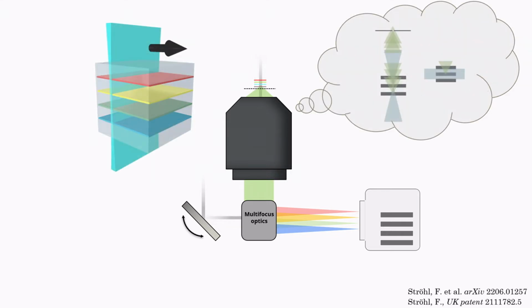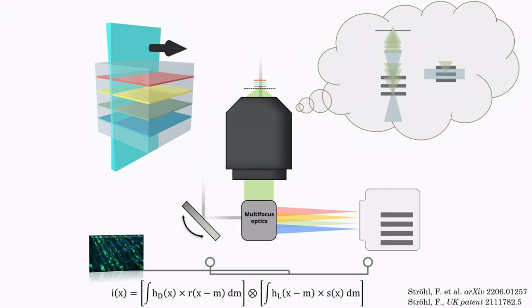And you can read about it in a bit more detail in the arXiv paper that got out, I think, 2 days ago. And that's, we put a bit of a drizzle of confocal microscopy in there. Think of it like this. If you connect your light sheet with your camera, and you would move the camera along, that means the PSF of the camera moves along with the PSF of the light sheet. Then in the math of the formula, these two move together, and under the convolution, they multiply.